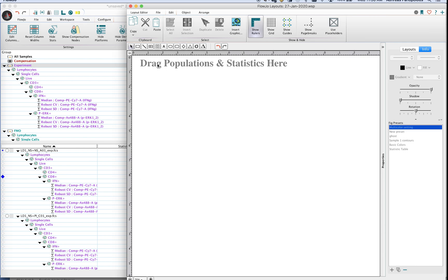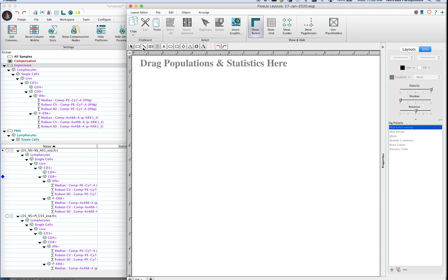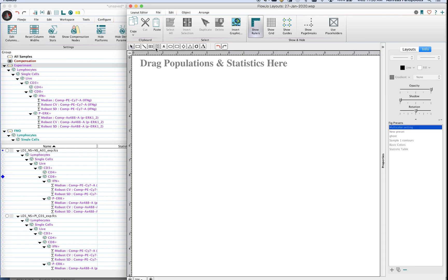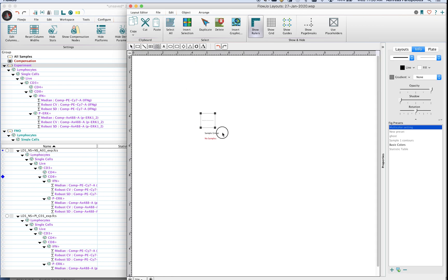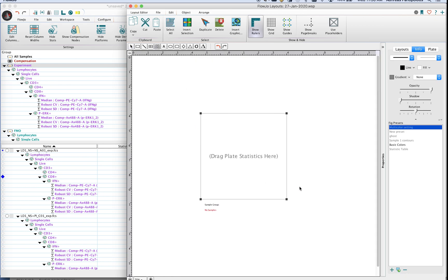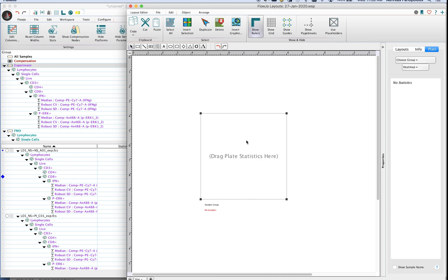Now in order to use this tool you have to be in the layout editor module and at the top of the layout editor sheet you will notice a series of tools. It's about the fourth or fifth one from the left there, it's labeled plate tool, it looks like a grid with four holes in it. You go ahead and click on that button and then click and drag in the layout editor itself.